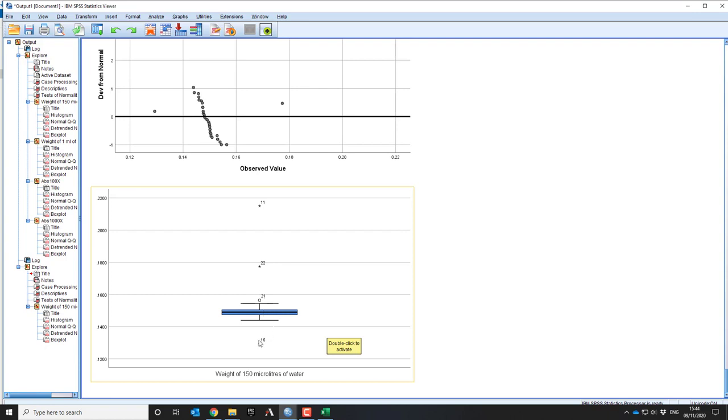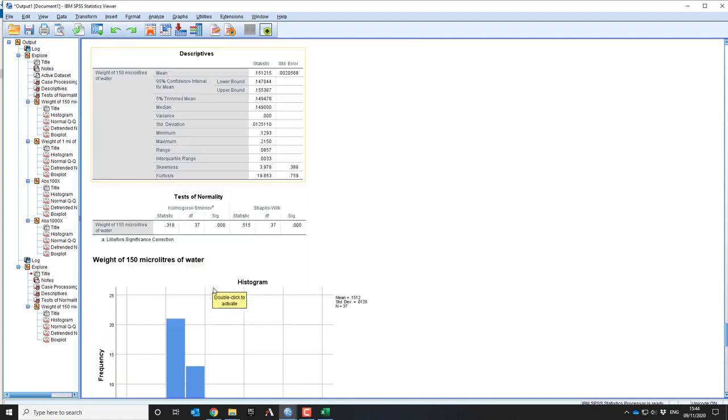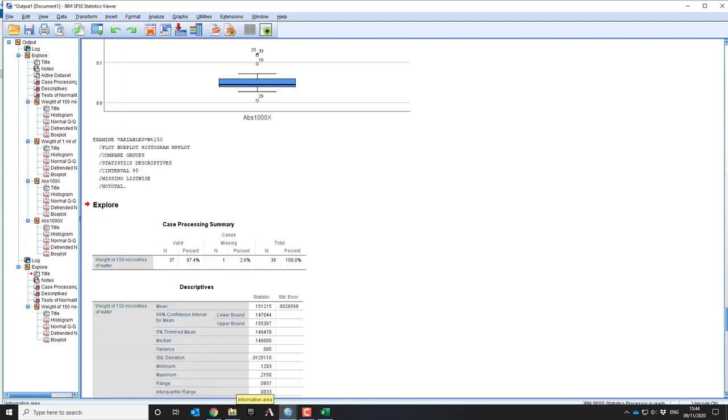The box plot is still struggling a bit, so now it's suggesting I've got one that's too small. So 22, 11 and 16 are poor data points. So that means 16, well, I'll have to look at what 16 is, and 22 means any value above 0.17 really. So let's go and alter it again.